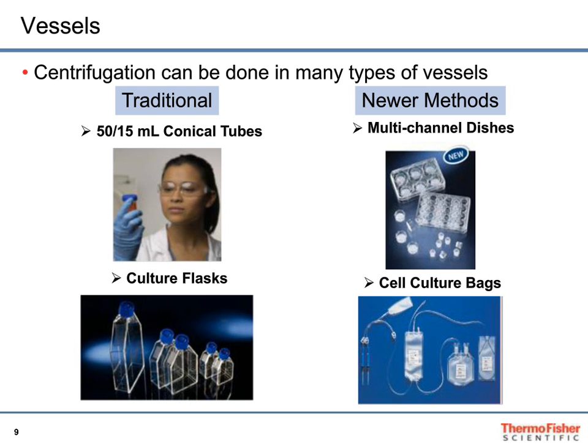And what we'll do in a centrifuge is typically try to get a centrifuge and a rotor to be as adaptable as possible with various adapters that you can put in there so that you don't end up buying a different rotor for every vessel. You can maybe get one rotor and then buy these different plastic adapters, as some of you are well aware, or even different buckets and things like that to make it as versatile as possible so that one purchase or one set of purchases can cover a wide variety of applications.